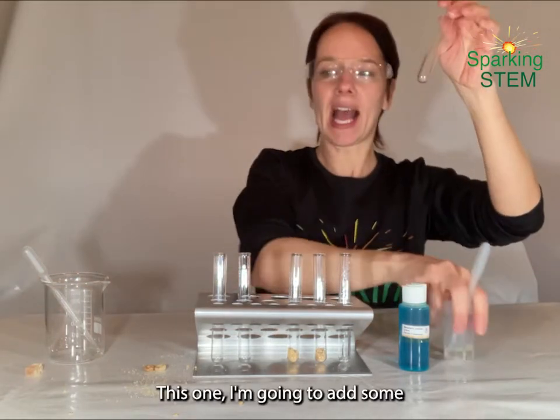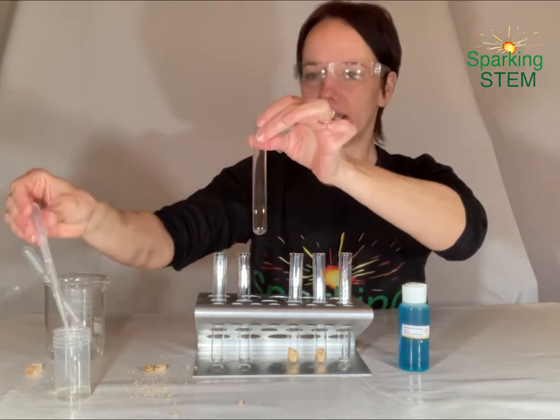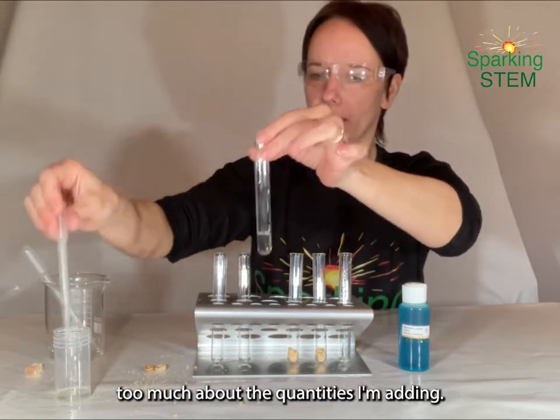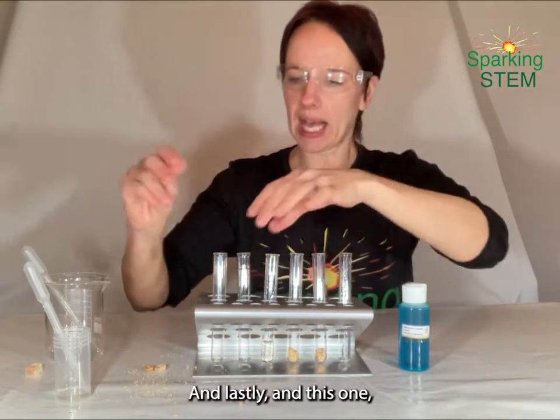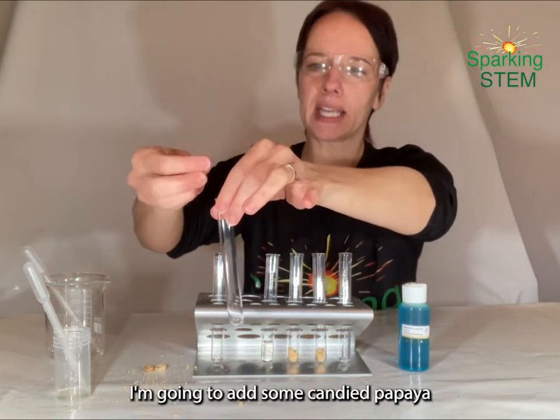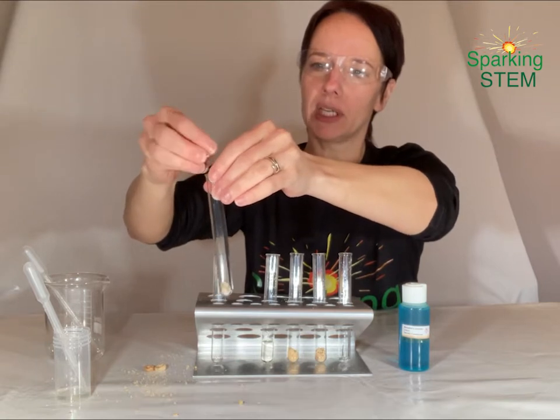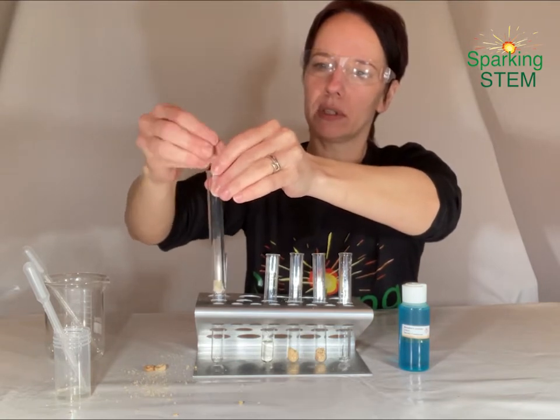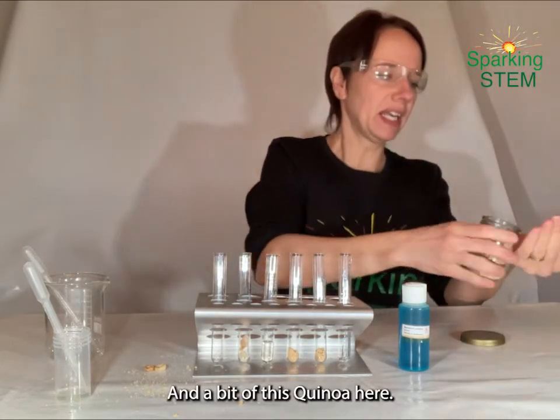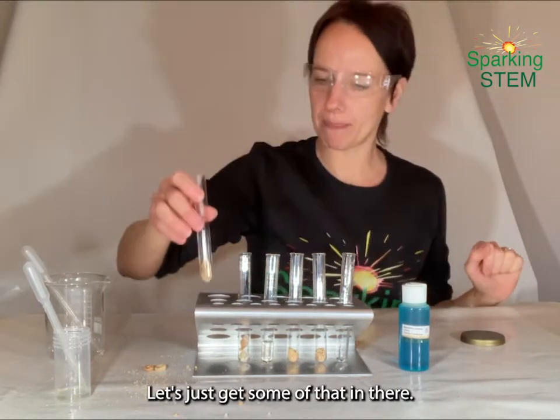This one, I'm going to add some liquid — a squash cordial, just fruit cordial. Here we go, just nice and simple, add a bit of that. I'm not going to worry too much about the different quantities I'm adding. And lastly, in this one, I'm going to add some candied papaya — some papaya fruit that has been candied. It's a bit gluey actually. And a bit of this quinoa pulse here — let's just chuck some of that in there.